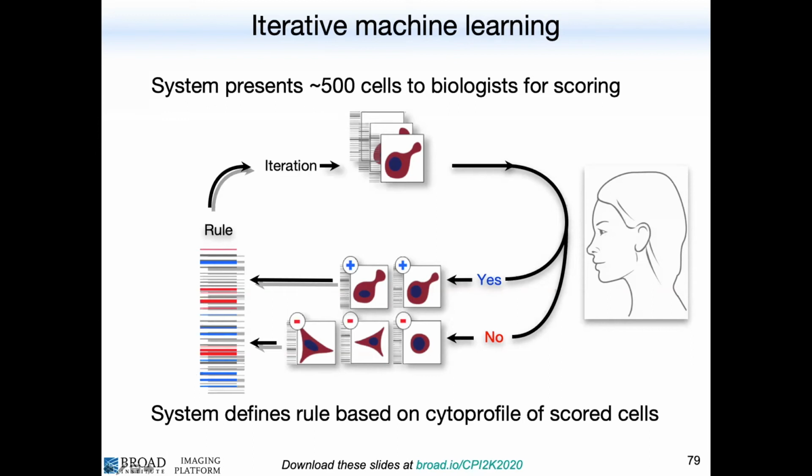You can do this several times until you create good rules that can separate all the objects, or in this case cells, in all of your images properly. The more measurements you create to make rules out of, the better chance you have of getting a good classification, where the computer has learned to distinguish between cells of one group and cells of another.